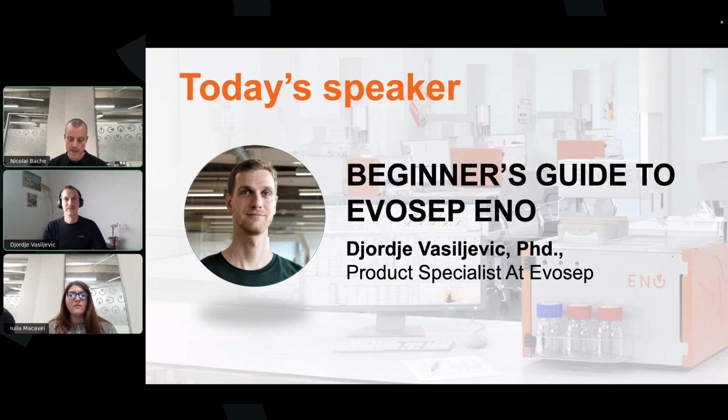So again, look into the Evosep literature. A few comments that will obviously affect these kinds of experiments are both related to which method you use and also how you detect the features, the peptides, because as you start to run faster, the mass spec method needs to be able to keep up.